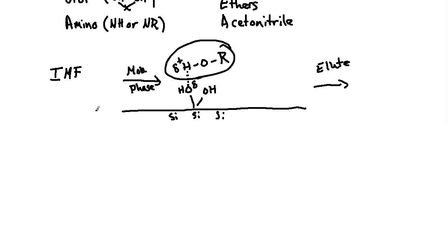Okay, so again, this phenomenon of intermolecular adherence to the column is often referred to as the process of localization, in which analytes are going to localize or stay in one area of the column and then will be separated through the elution of nonpolar solvents, maybe with some slightly increasing polarity if you try to do a phase gradient sort of thing. If you're going to do phase gradient HPLC, you need to make sure that your solvents won't demix, that they will stay mixed thoroughly when you're doing that. Sometimes that can be a larger concern when you're on the nonpolar end.